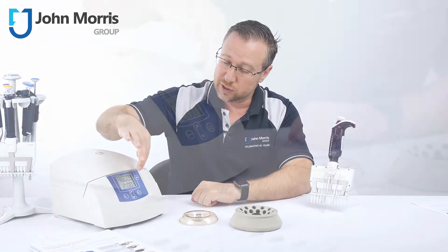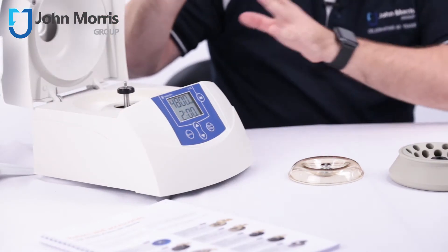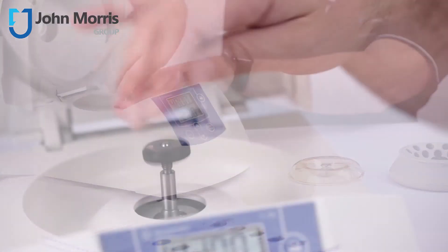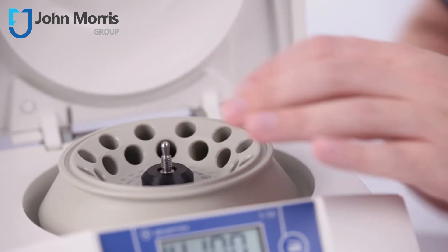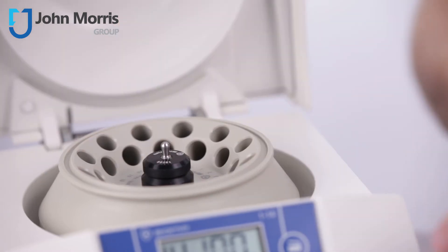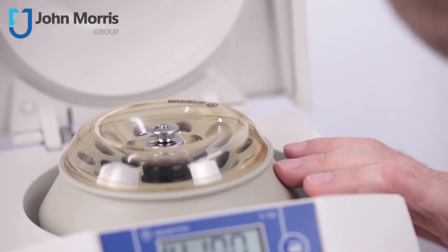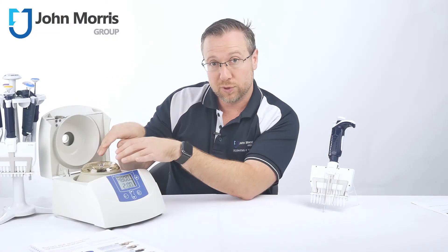You have this handy automated opening system, and loading a rotor is actually really, really easy — I'm going to do it for you right now. Once it's loaded, put your samples in.